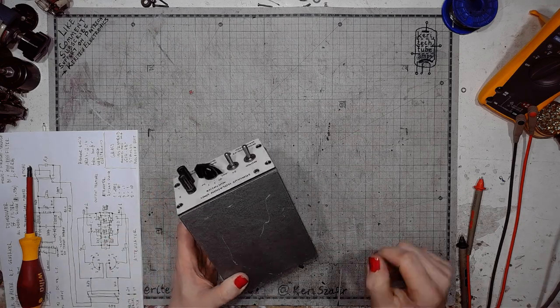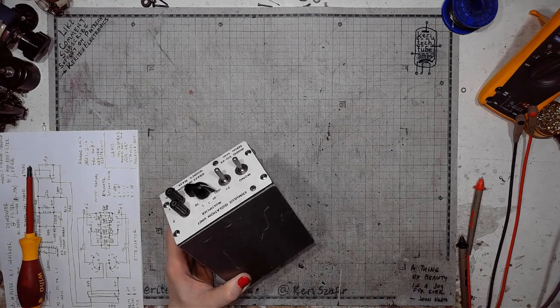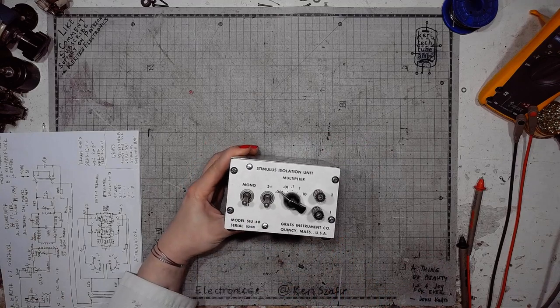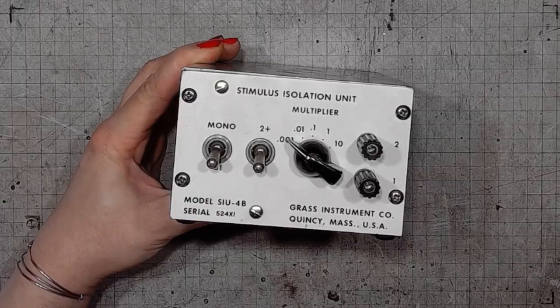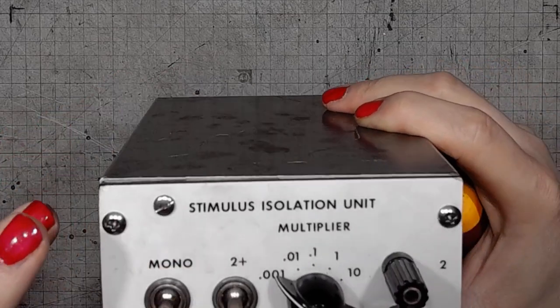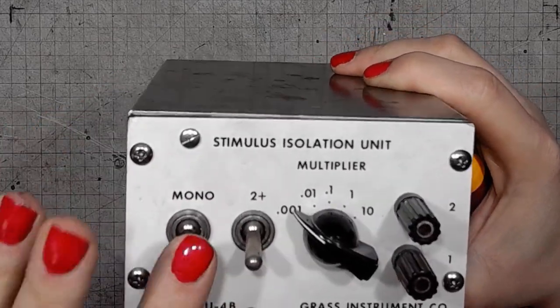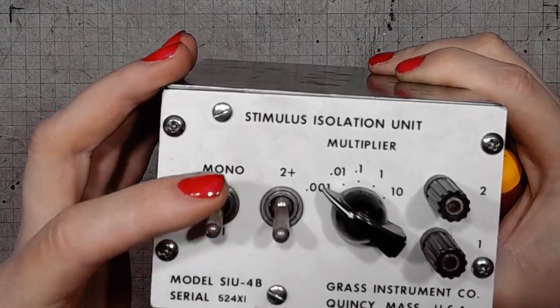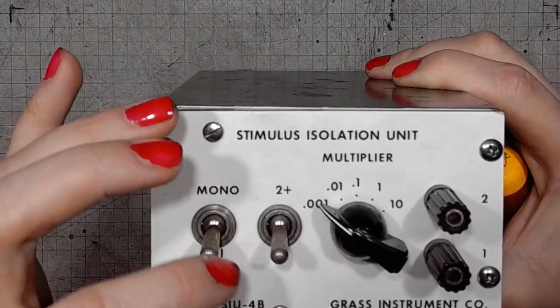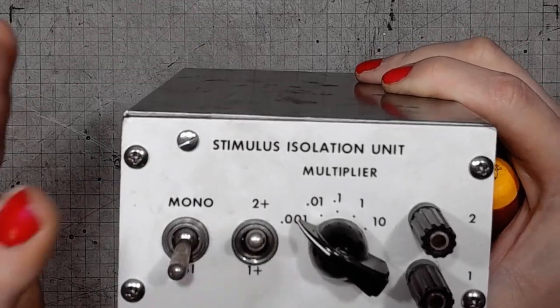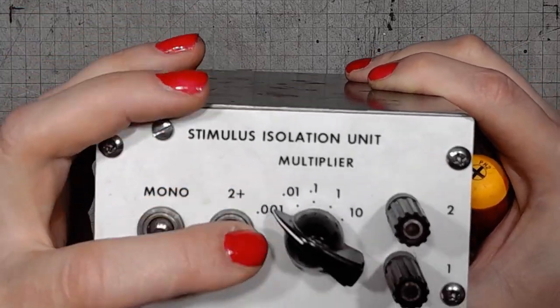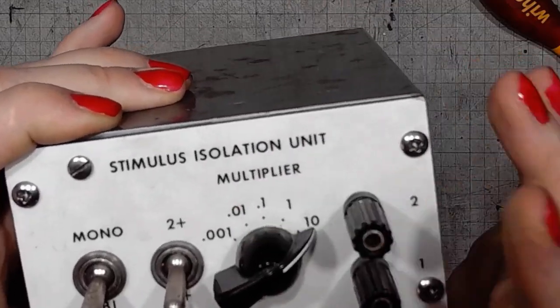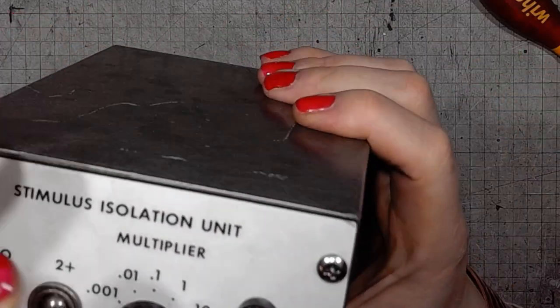Here we are at the bench. Let's zoom on in. The front panel has two pretty cryptic switches: mono and bi, 2+, and 1+. We'll find out what those switches do. There's also a range switch and a pair of terminals.